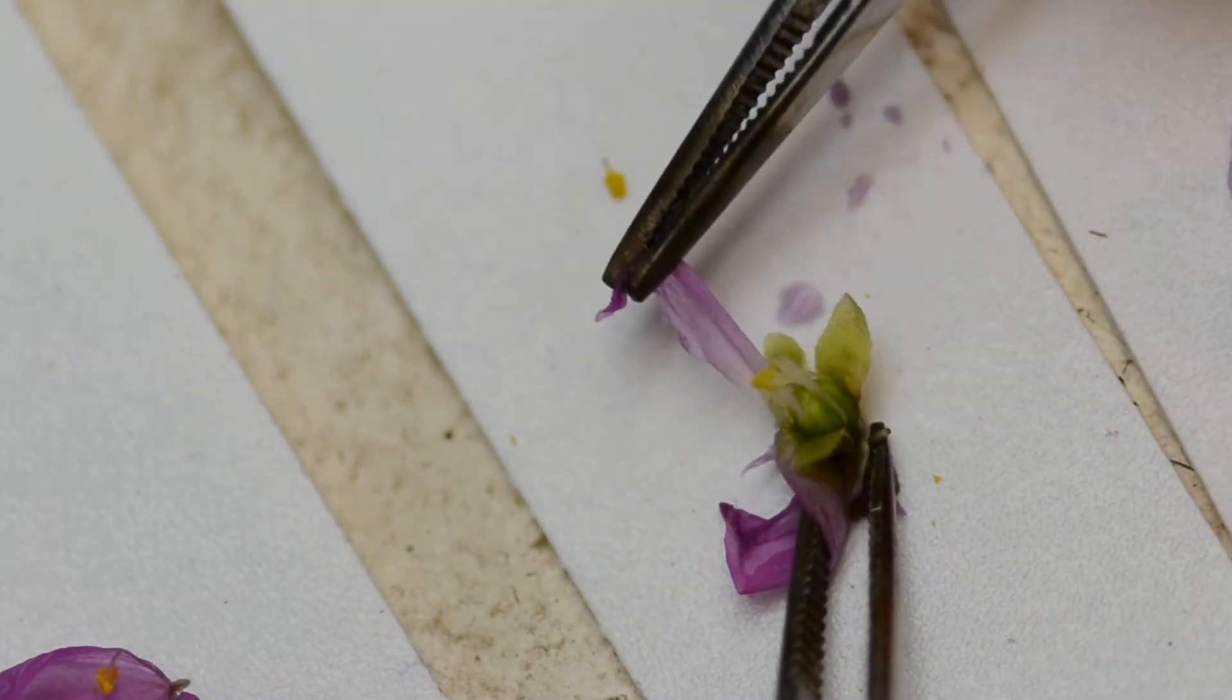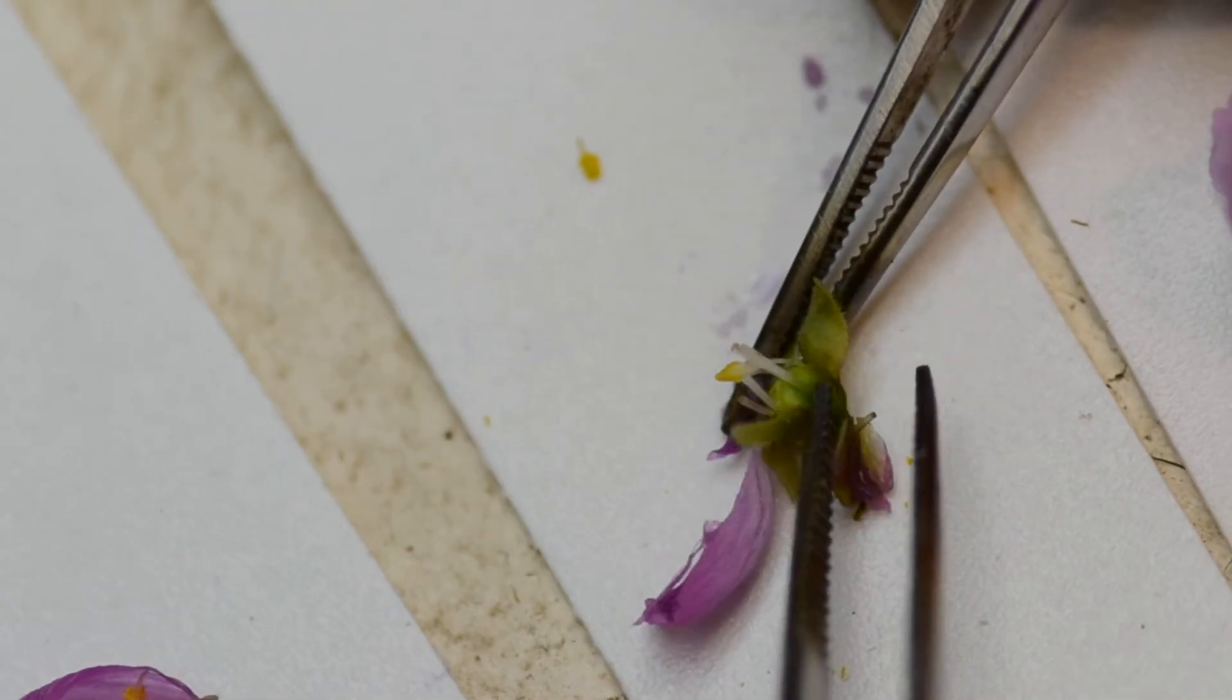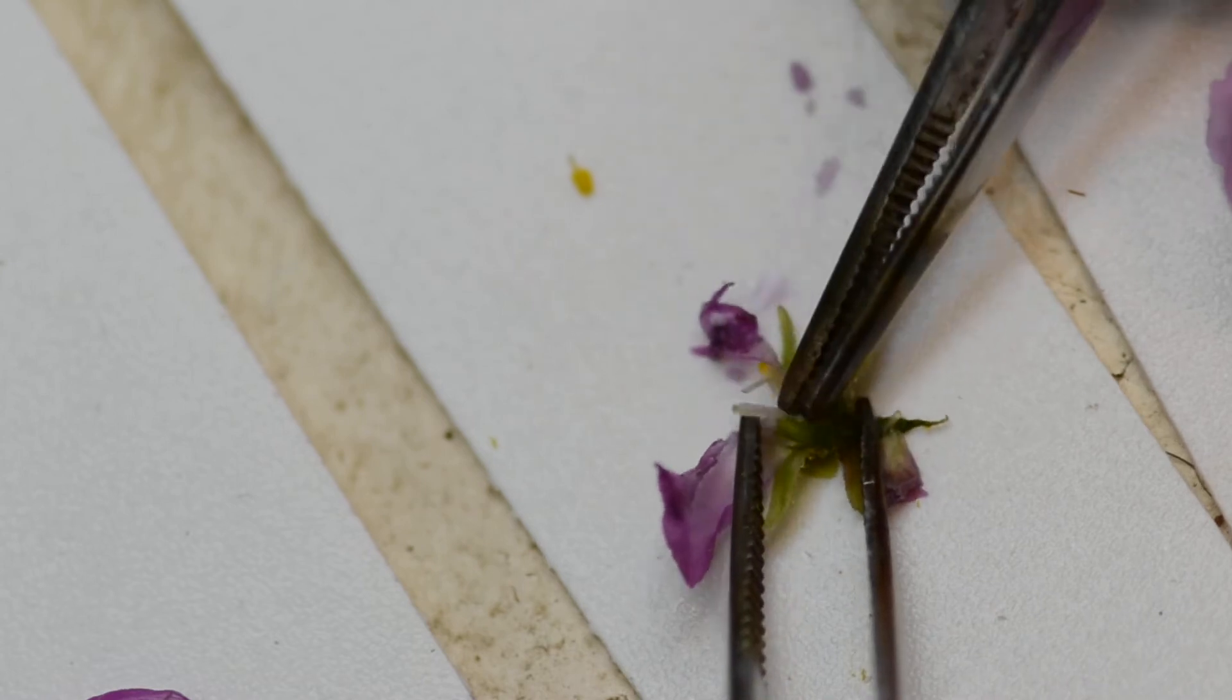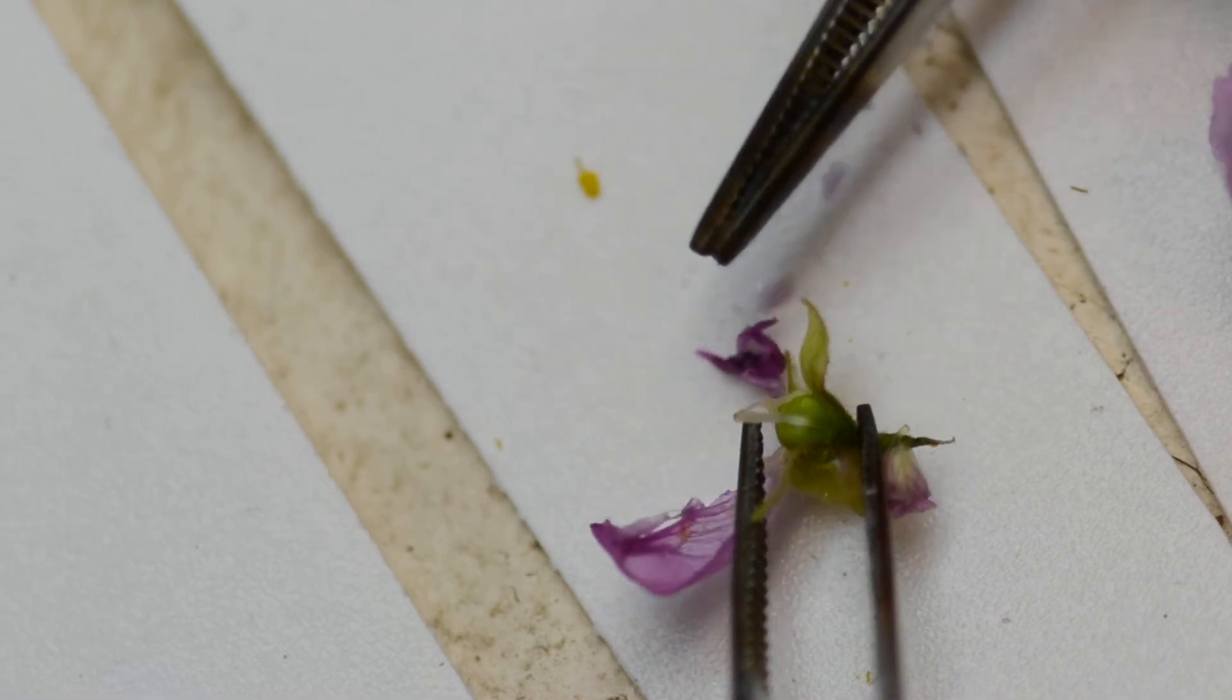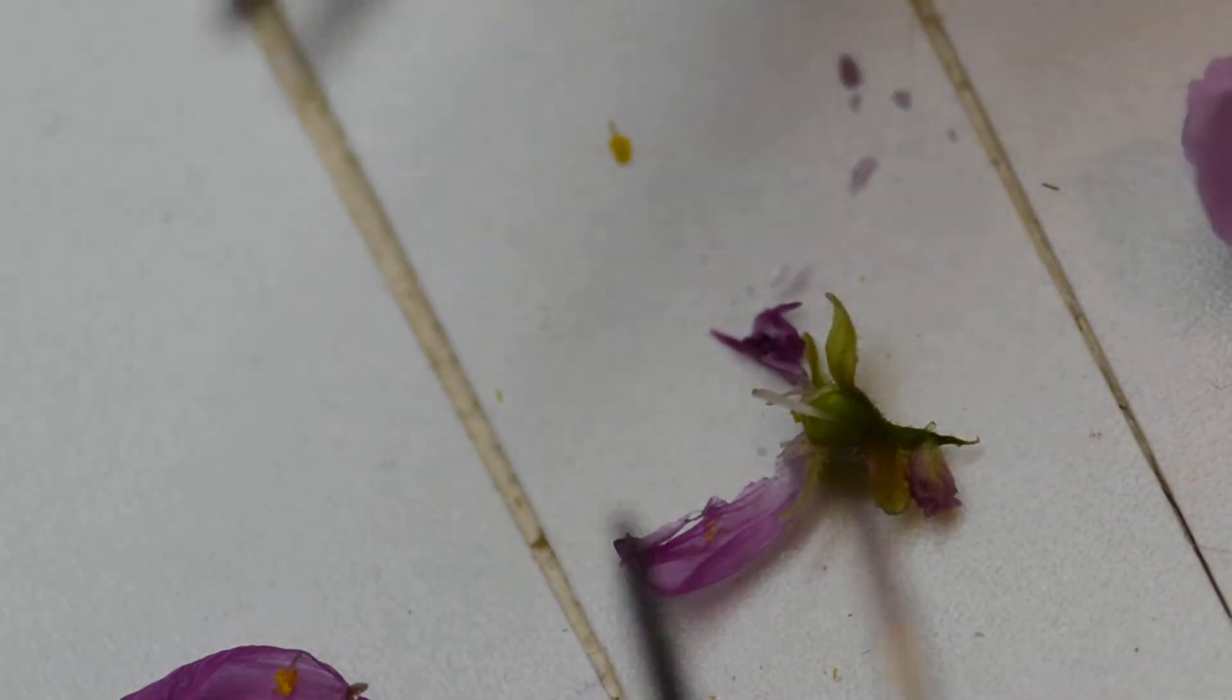So after the stigmas are pollinated, the pollen germinates all the way down into the ovary. And the ovary is divided into three parts in the case of this species, and most of Drosera is three parts.